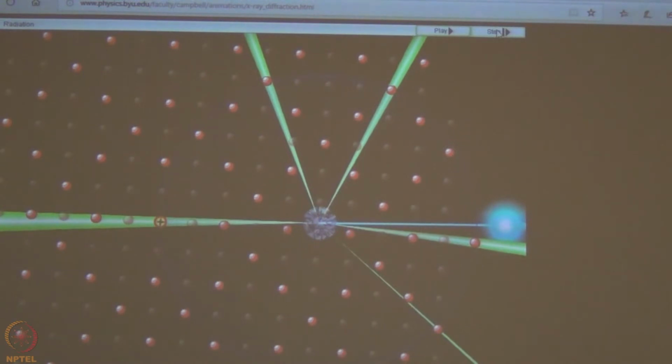So in 3 or 4 frames you will have the same spot. Starting with a very small intensity, the next one will have slightly higher intensity, the third one will have maximum intensity, the fourth one very low, the fifth one almost nothing, and the sixth one 0. So if you measure the intensity in terms of electrons, and plot the number of electrons versus angle of rotation, you should get a Gaussian type of curve.